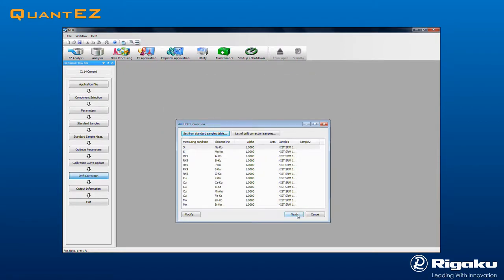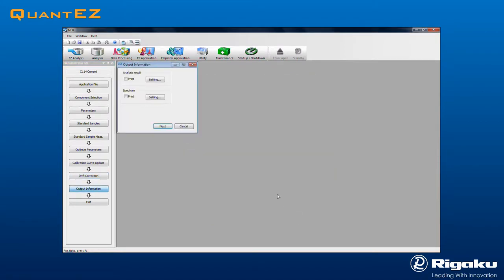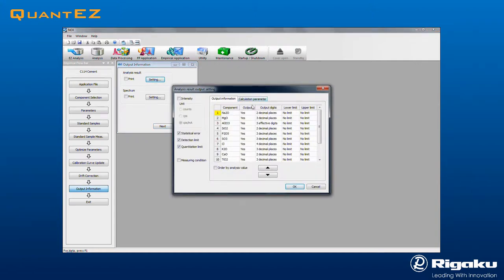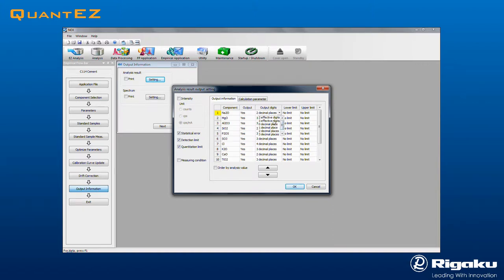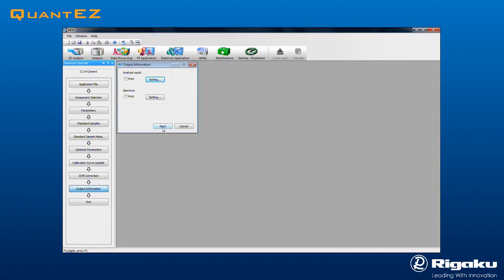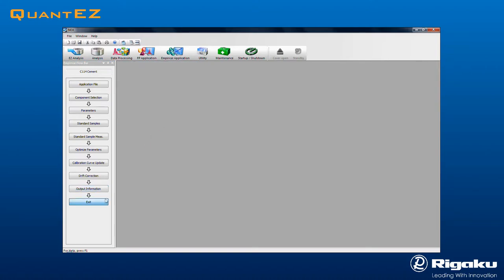Clicking Next brings up the Output Information dialog box, where results reports may be designated. Select the number of significant digits required. One can also select whether to show other information, like intensity, statistical error, detection limit, or quantitation limit. For process control applications, high and low values may be entered for each component to give a pass-fail on the report. Then click OK to exit, followed by Next and Exit to complete.